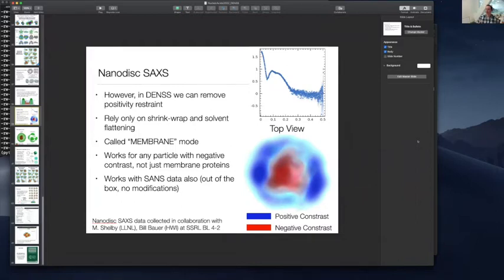And with a collaborator who was testing some stuff, I've done viruses. Viruses are great. They work. But I have also done entire bacterial cells. We did Staphylococcus and, what was the other one? Some other one. One turned out with a rod-like shape and one with a spherical shape, which is exactly what it was supposed to be. So far we've even done whole cells, which tells me that there's really no size limit. I should take the Fourier transform of a picture of myself and see what the SAXS reconstruction is, just to see what the limits are.